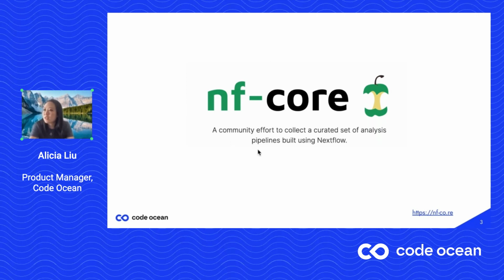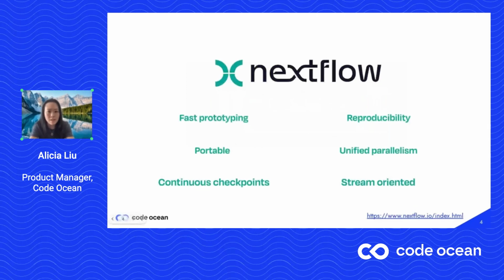So of course that leads us to the question, what is Nextflow? Nextflow is a workflow manager that allows you to chain together different steps into a scalable and reproducible pipeline. Nextflow is very popular amongst the bioinformatics community because it is able to handle the complexity and parallelization required in many modern bioinformatics analyses. So you can see on the screen here some key features of Nextflow. I'm not going to cover any of this in depth, just going to mention that Nextflow is a very powerful tool for building and running pipelines.